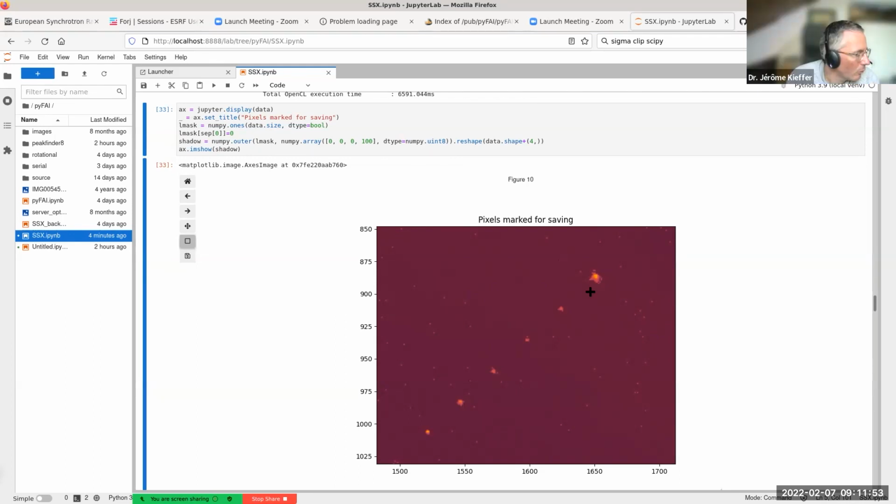About twice the fastest that can be done today with PCI Express 4. So it uses some dedicated link to transfer the data to the GPU, and from there we are able, theoretically, to process data at 1000 frames per second on 2 GPUs.